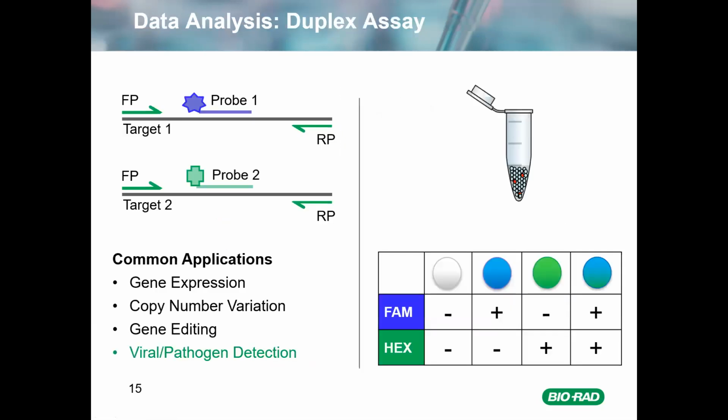Now, for a duplex assay, we are going to be adding, and oftentimes this is done using probes, a separate primer and probe target.